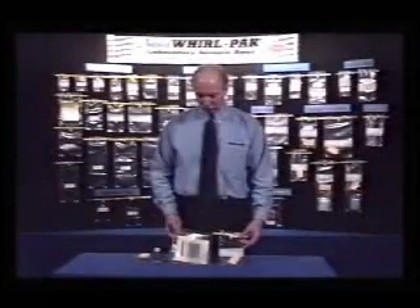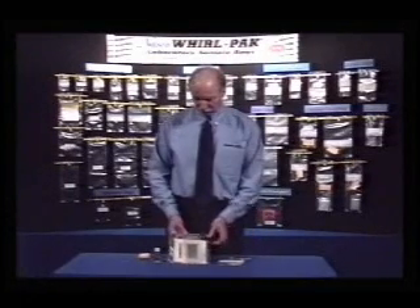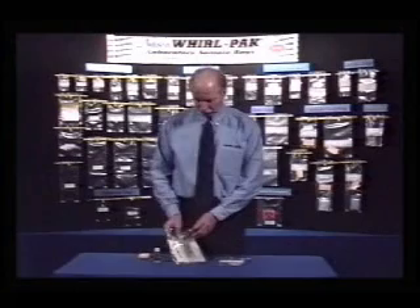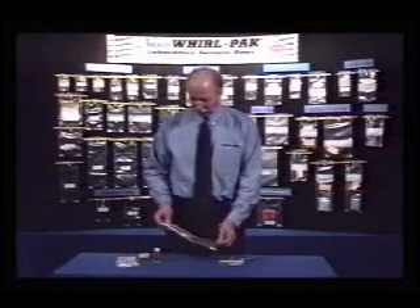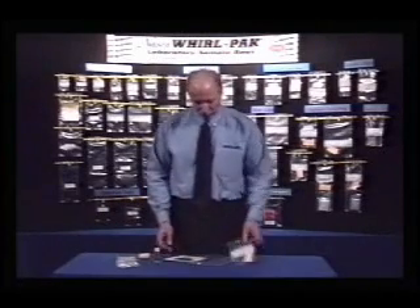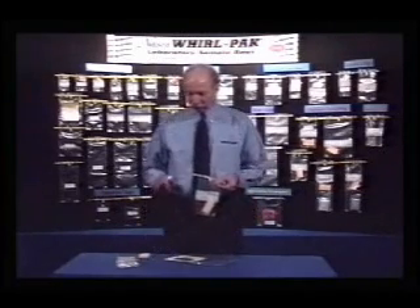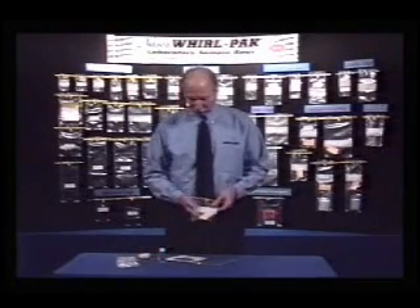NASCO provides a carcass sampling kit designed for testing meat, turkey, and other large poultry carcasses for the presence of E. coli. This kit includes a pair of sterile gloves, two sterile disposable templates — one for poultry and one for meat — a Whirl-Pak sponge bag, and 25 mls of buffered peptone water.